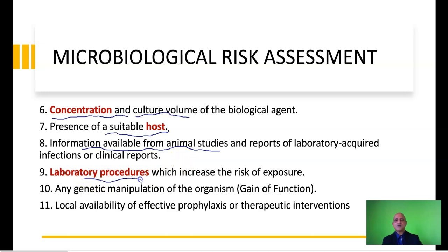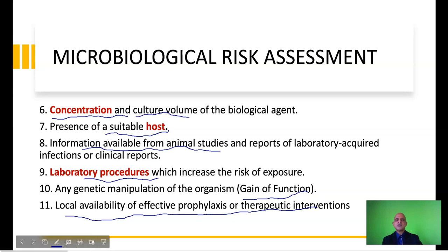And finally, you have to focus on laboratory procedures which may increase the risk of exposure. There's another key aspect, which is the genetic manipulation of the organism. Most diagnostic labs do not work with pathogens that are genetically modified. However, if you are working in a research laboratory, you must look at gain of function, which I will explain to you in the next few slides. And then the local availability of effective prophylaxis and therapeutic interventions. If you are working in a country in which you do not have access to proper therapies for the control or containment of the pathogen, please consider the risk of working with that particular biological agent or pathogen.